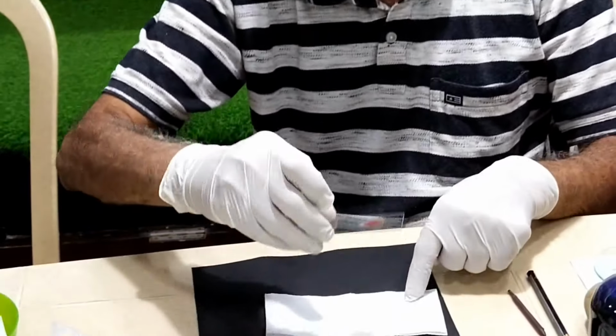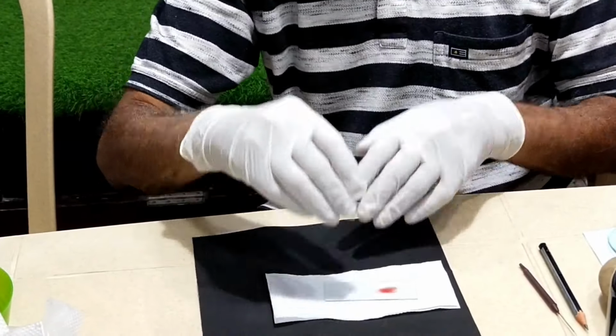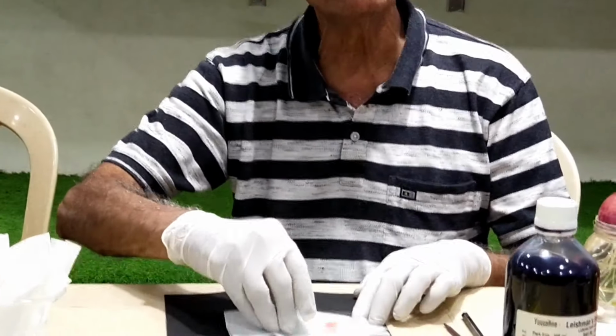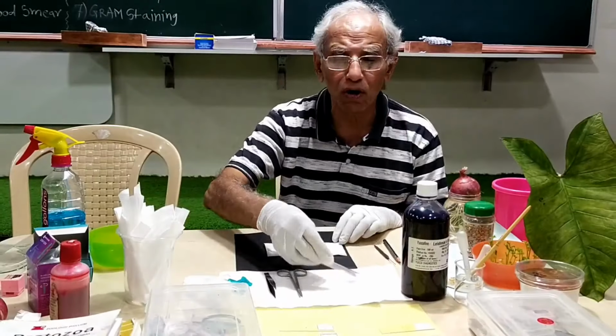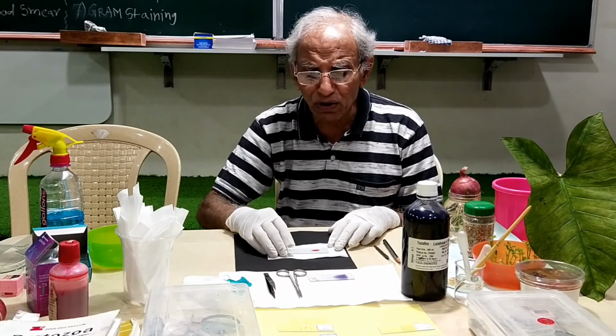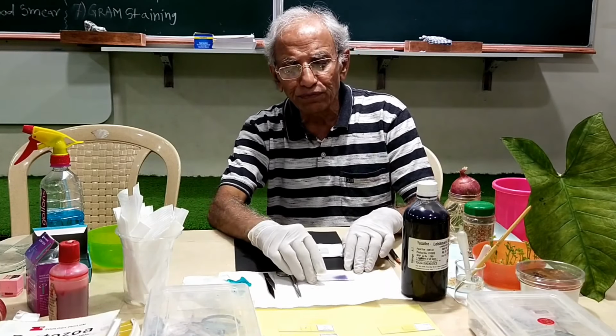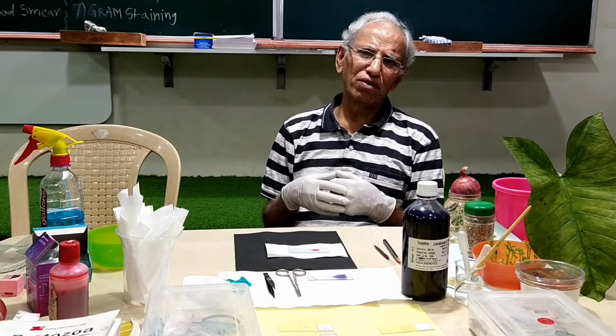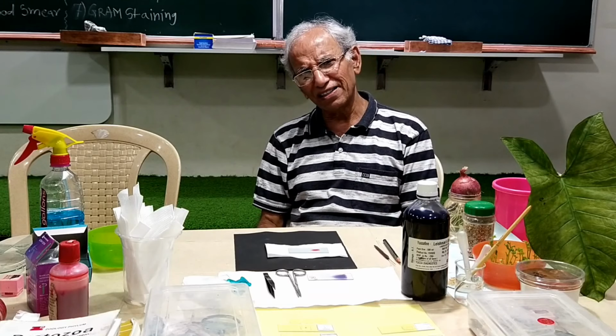Well, this is the spread that we have done, and we can then arrange this under the microscope, and you can see this one which is freshly done, and also you will be able to observe the prepared slide with the white blood cells. This is what we will do, and this is a very simple way, because our purpose today is simple. We want to know the different types of cells.